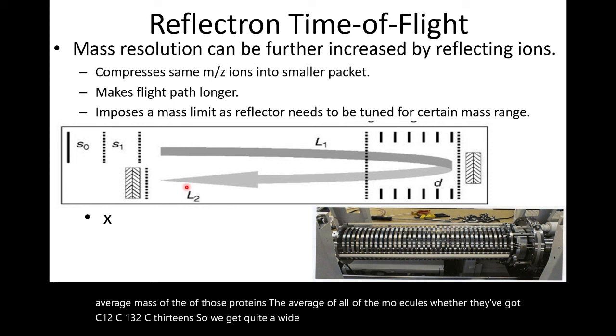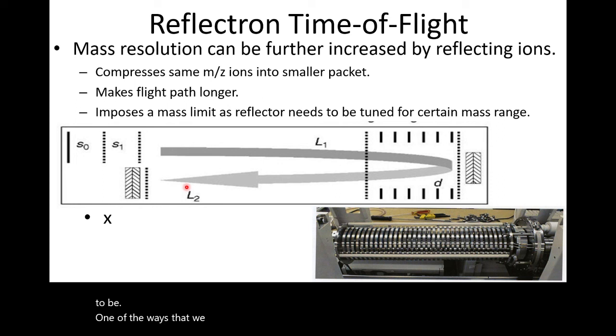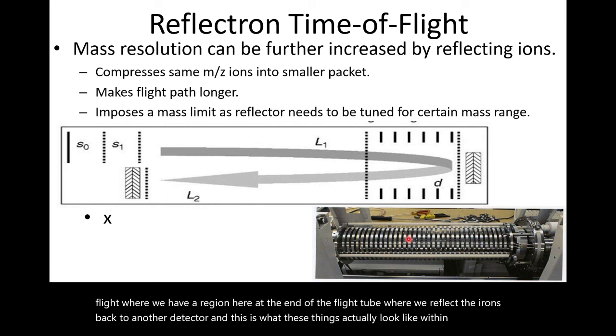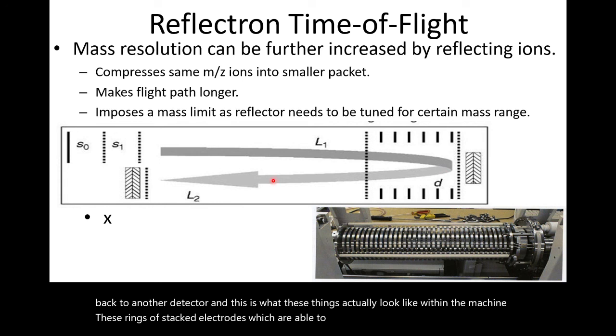One of the ways that we can increase the mass resolution is by using reflector time of flight, where we have a region here at the end of the flight tube where we reflect the ions back to another detector. And this is what these things actually look like within the machine, these rings of stacked electrodes, which are able to reflect charged molecules back.